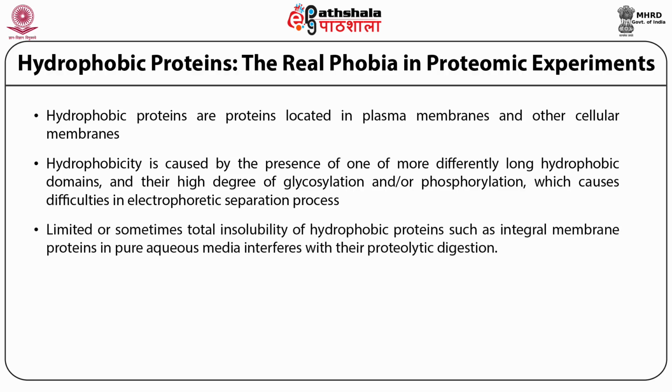Limited or sometimes complete insolubility of these hydrophobic proteins, such as integral membrane proteins, in pure aqueous media interferes with proteolytic digestion.